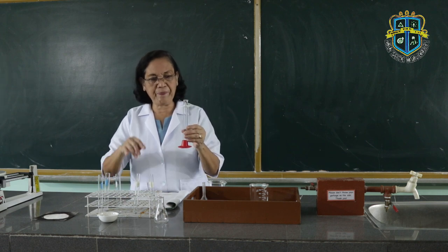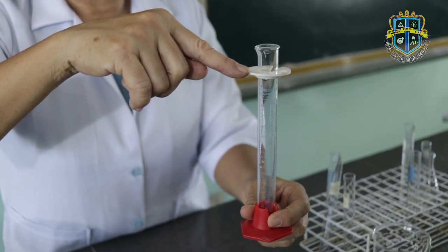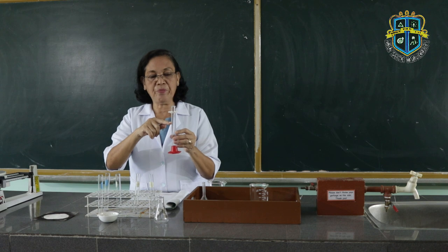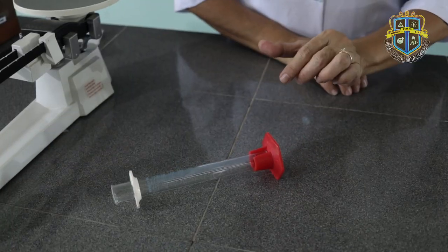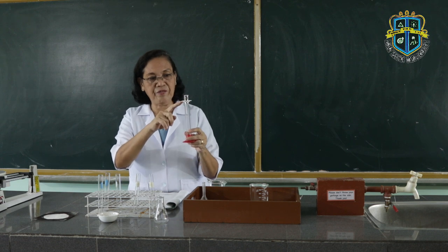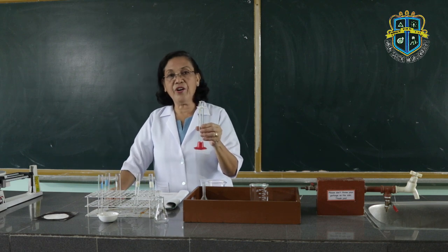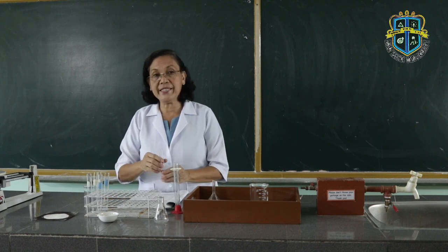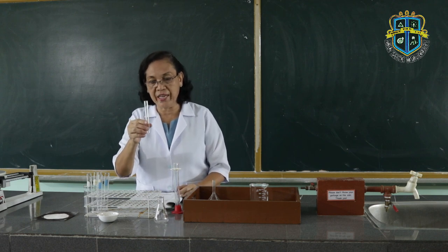If you are going to look at this graduated cylinder, here is what we call a collar. This collar serves as a protection of the graduated cylinder in order not to be broken when it falls. That's the purpose of the collar. Now, the first procedure is you are going to measure the volume of liquid inside a test tube — for example, the volume of liquid that this test tube can accommodate.